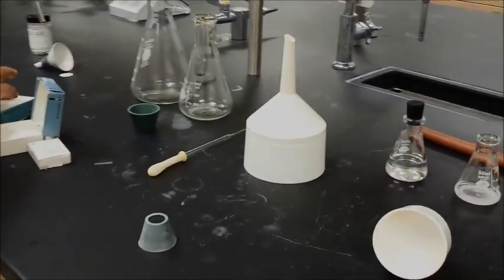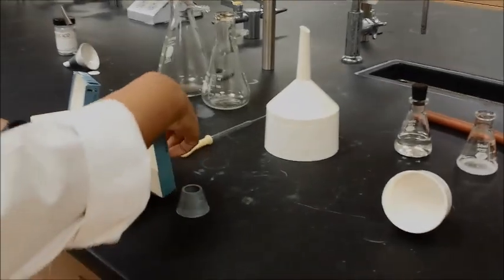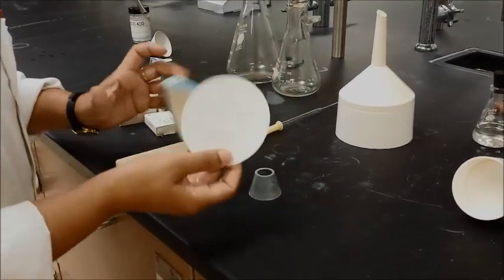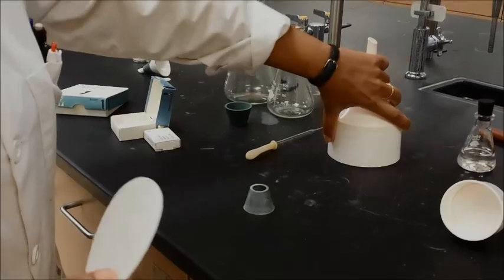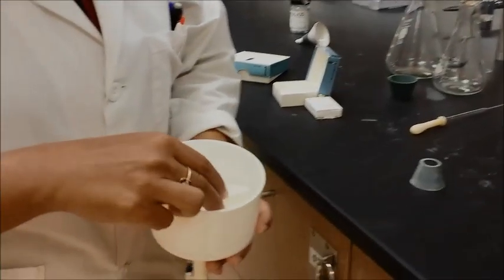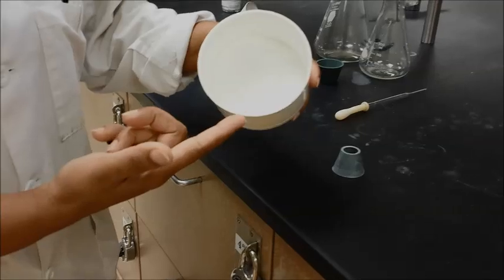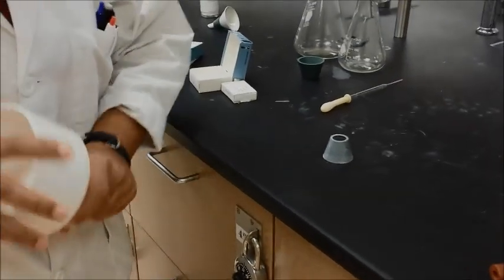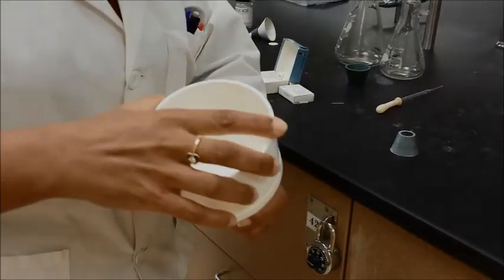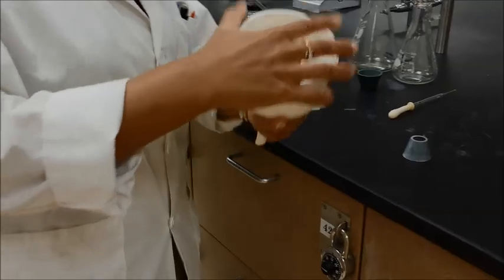If you have a larger Buchner funnel, then you need to get a larger filter paper. That one was 5.5, this one is a 9 centimeter size Buchner funnel. So now, again, you need a filter paper that will cover all the holes in there. And this one also separates out, so be very careful when you're placing it in the filter flask and removing it from there.